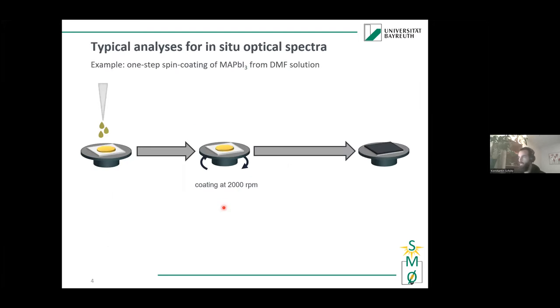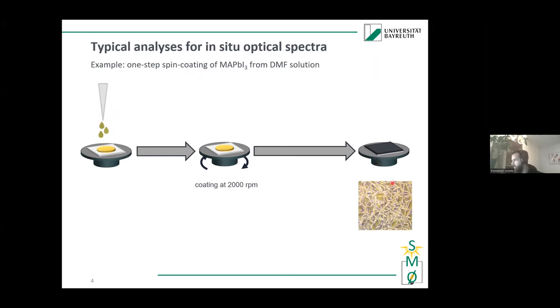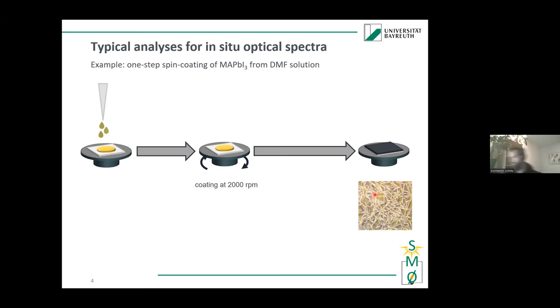Let's look at an example: a one-step coating of MAPI from DMF solution. One-step coating means all precursors are in the solvent DMF, you spin coat for a certain time, and end up with a film. For this system, the resulting film is not very nice — a needle structure forms, which is a solvent complex phase where solvent molecules form an ordered structure with the MAI and PbI2. These solvent structures are then partly transformed into perovskite.